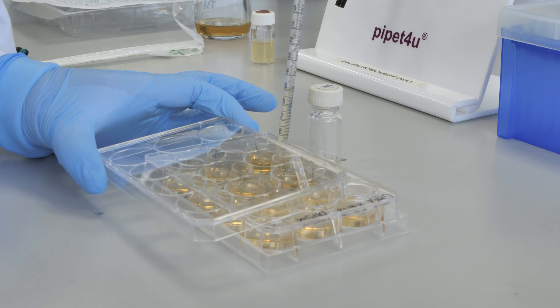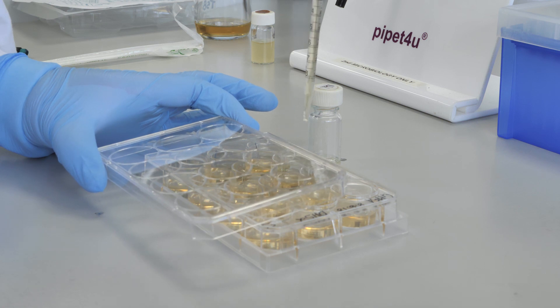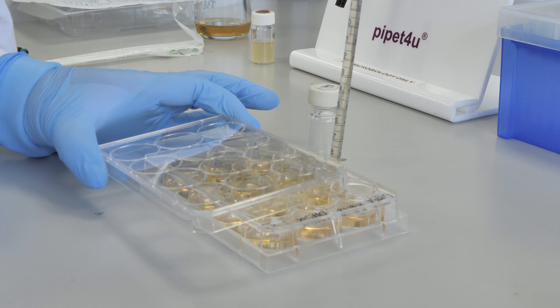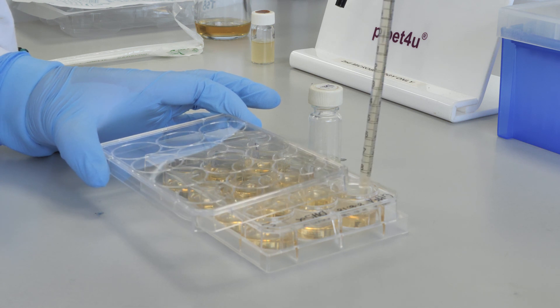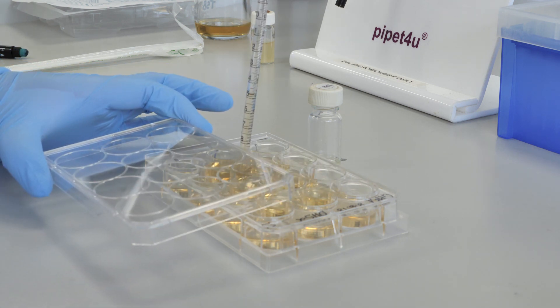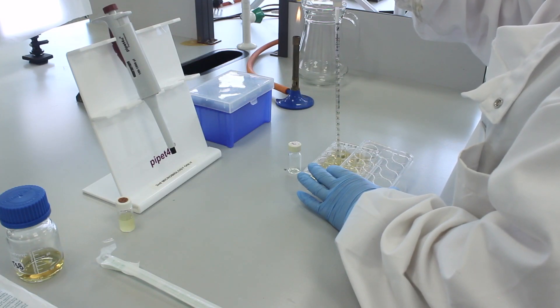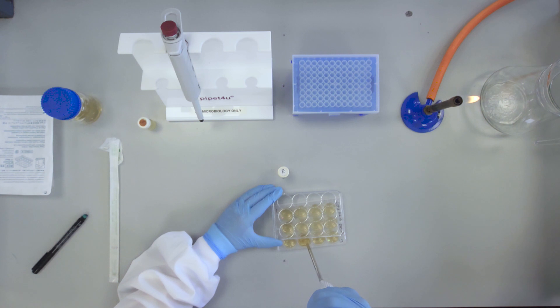Take 2ml from this well and add to well number 2 and repeat the mixing. Take 2ml from well number 2 and pipette into well number 3 and again pipette up and down to mix. Repeat these steps up until well number 11.